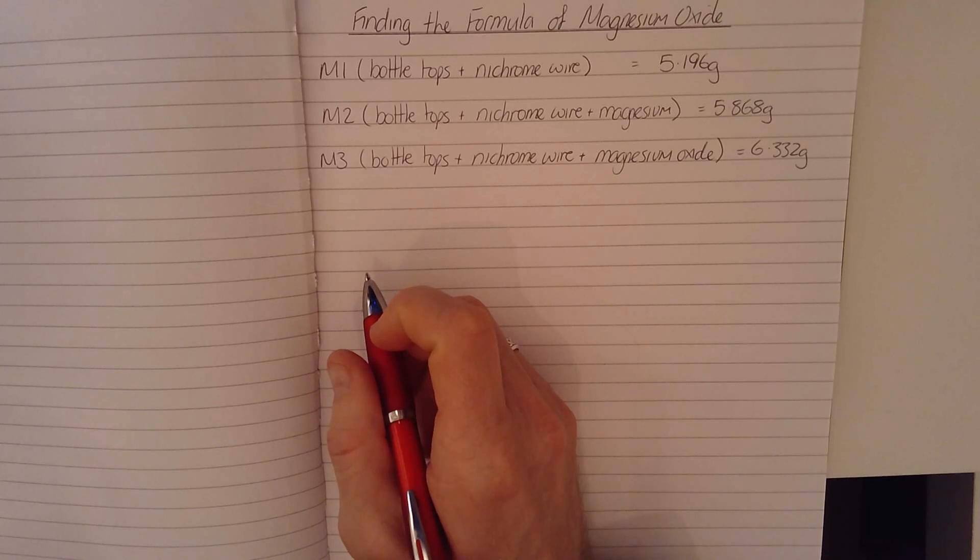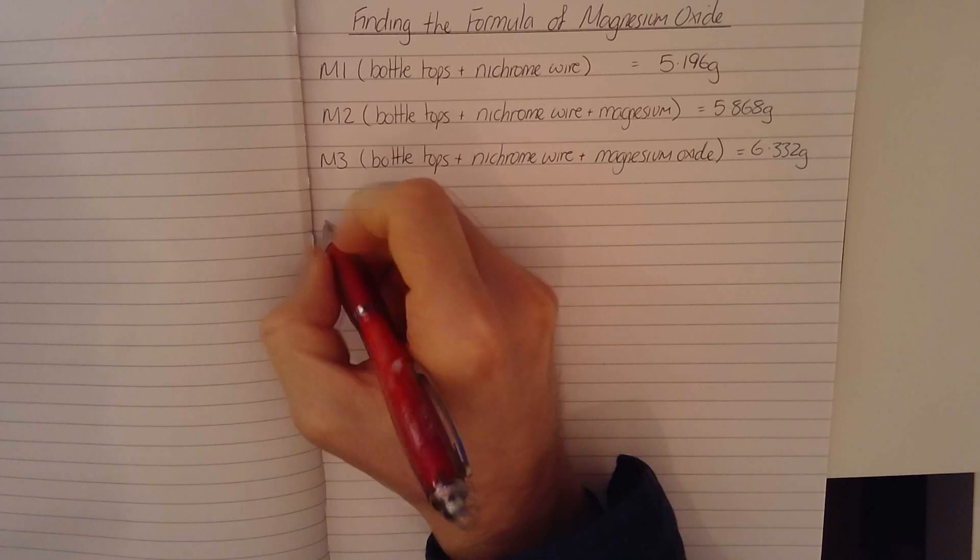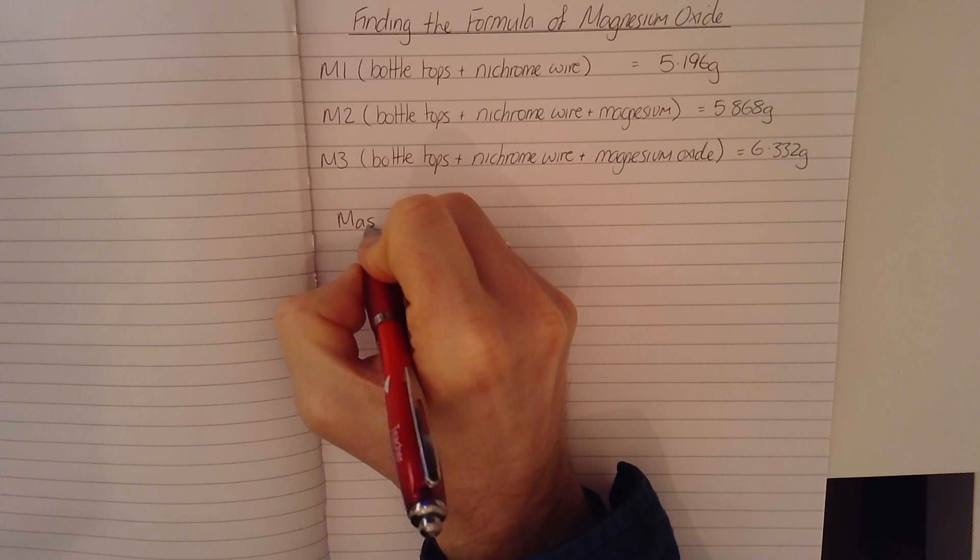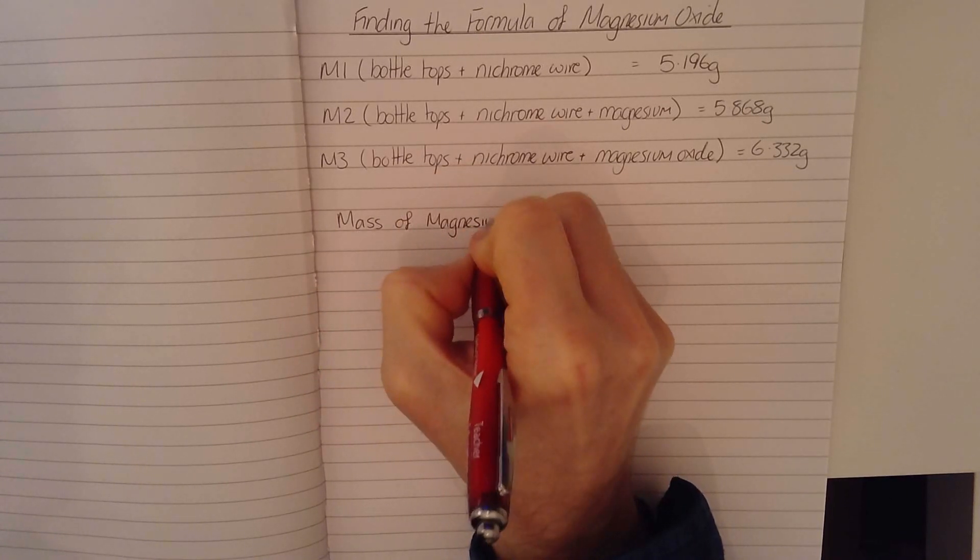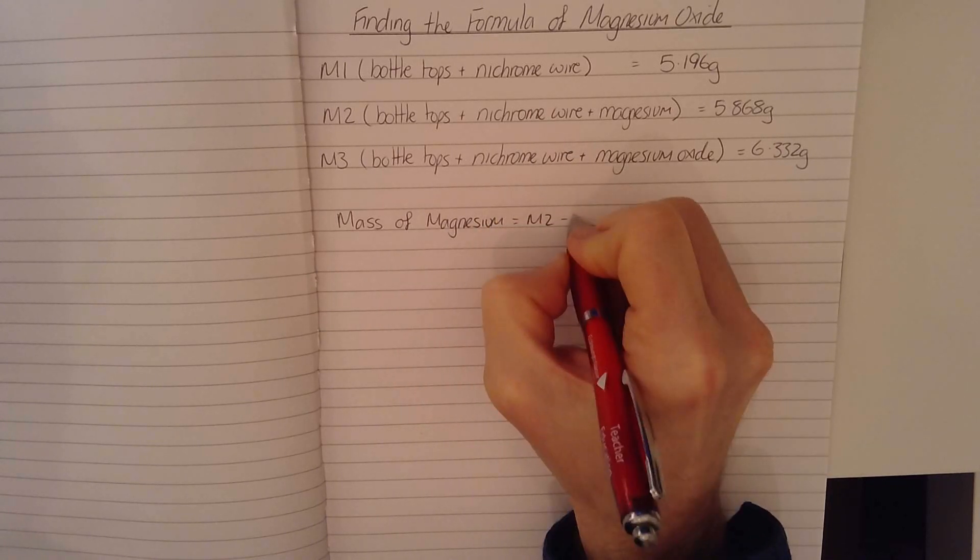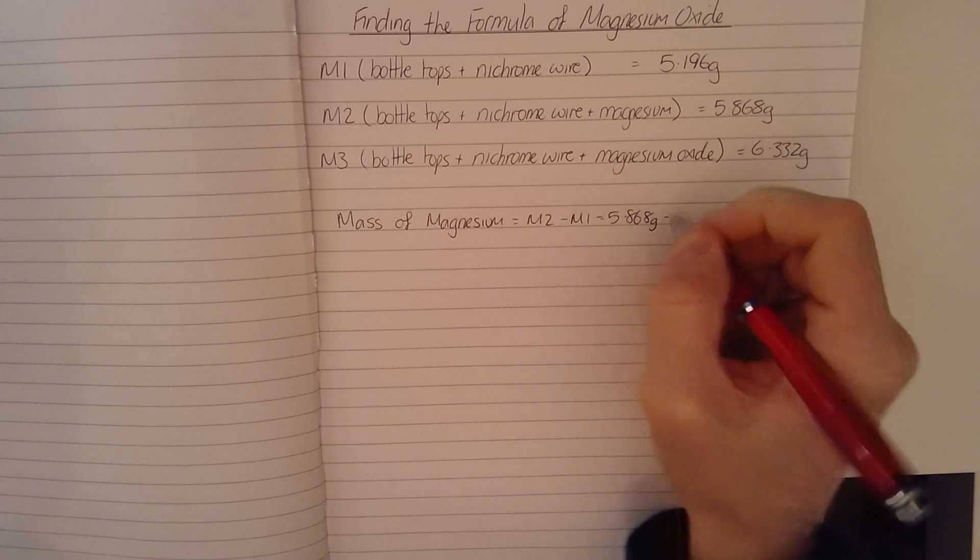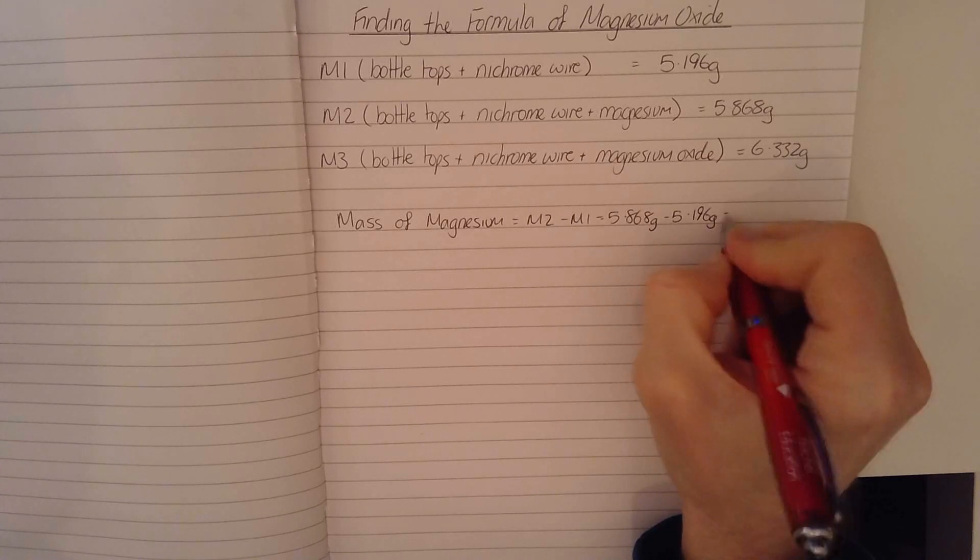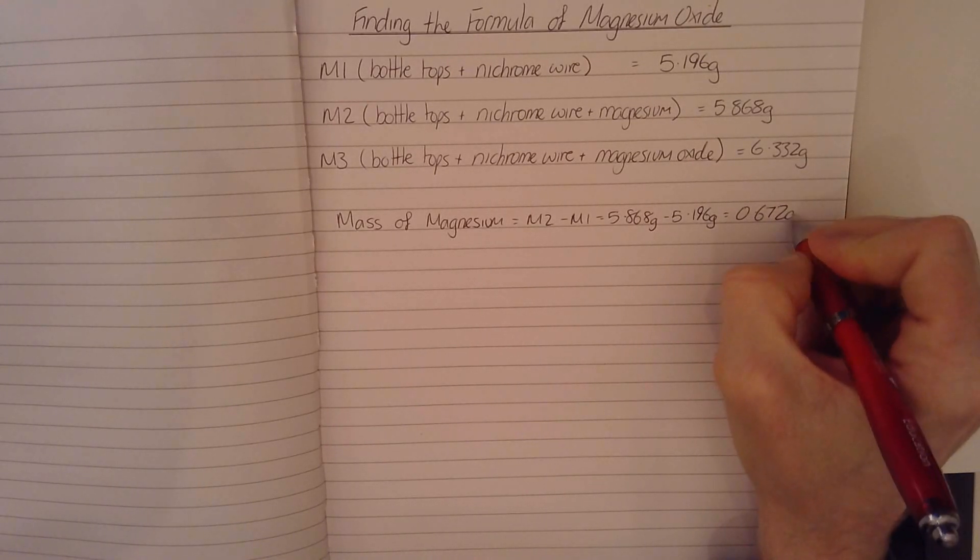So I can work out the mass of magnesium that was in the bottle tops by simply taking M2 and subtracting M1. So the mass of magnesium equals M2 minus M1 equals 5.868 grams minus 5.196 grams. And I've got a calculator at the side here. I can do that. And that is 0.672 grams.